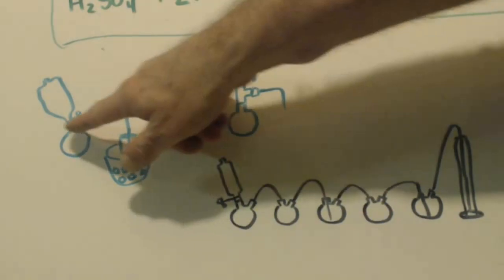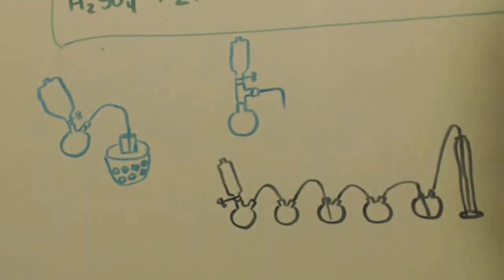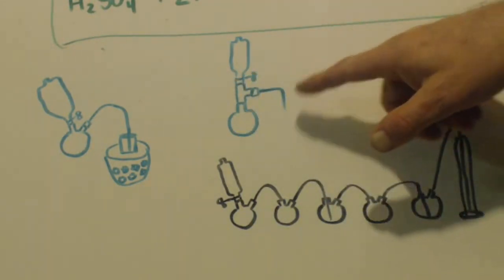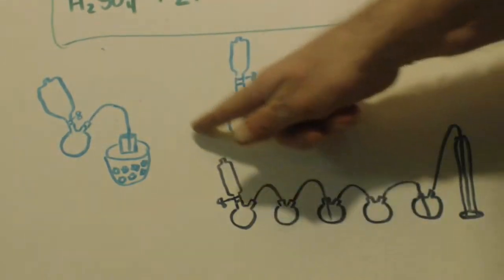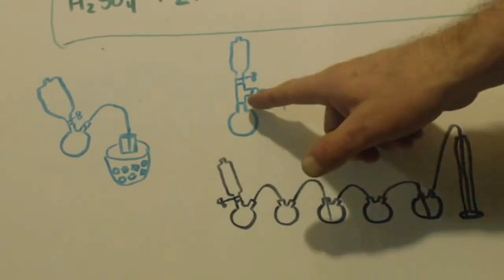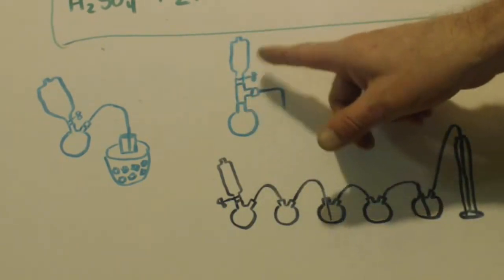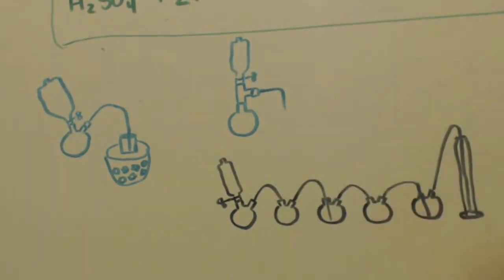Now, if you don't have two round bottom flasks, you can always do this. This T part would be like for distillation, but instead of going to a condenser, you'd go to a hose, just like over here, right? You'd lead that hose into that cup of water that's in the ice bath. Here's your separatory funnel. Here's your valve. So if you don't have any two-neck round bottom flasks, you just have one. You can always be creative, which you'll see with my setup, which is this.